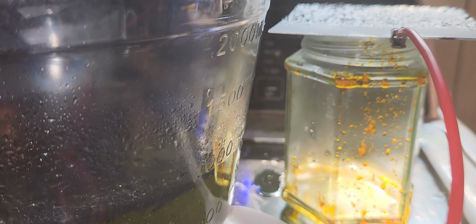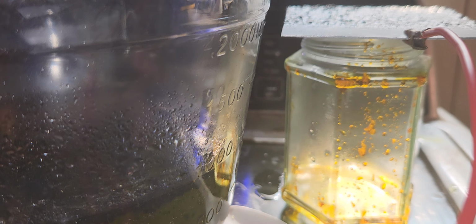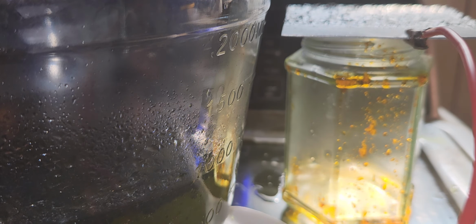I find it's interesting that it actually produces this type of coating right onto the electrode. The copper plates too. It's interesting enough that it can work. I never imagined that you could electroplate Dragendorff reagent onto aluminum, but you can. Cool video.